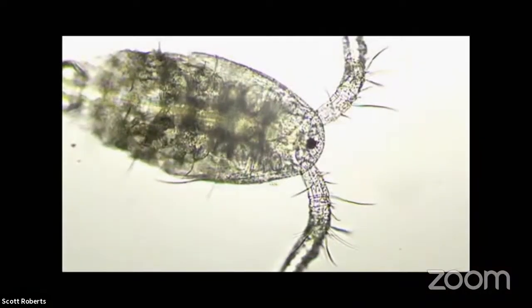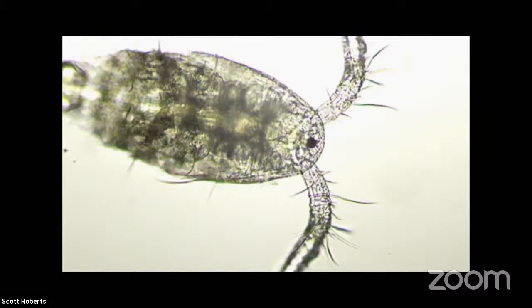And I'll show you a video capture I did of something called a copepod, which will come up right now. So we'll show you the video that I did, and then I'm going to jump to my presentation about the world of microscopy. But this is the video that I did. Now, this is a crustacean, and right here at the head, you can see there's a little black spot. Depending on the illumination that I used and the contrast and saturation that I set, this actually appeared red, and it is an eye of sorts.